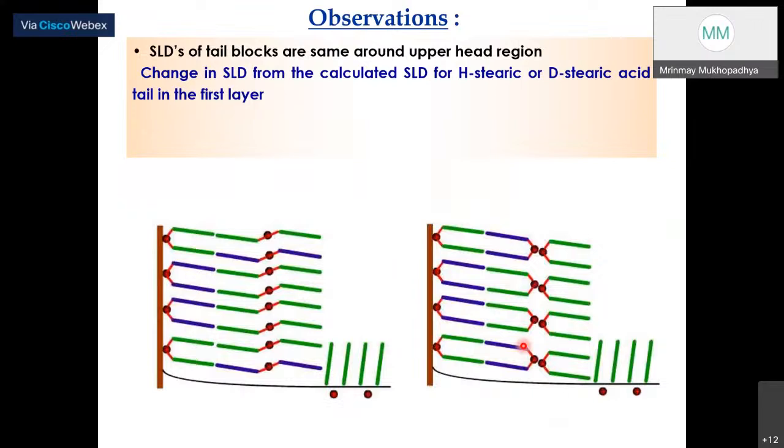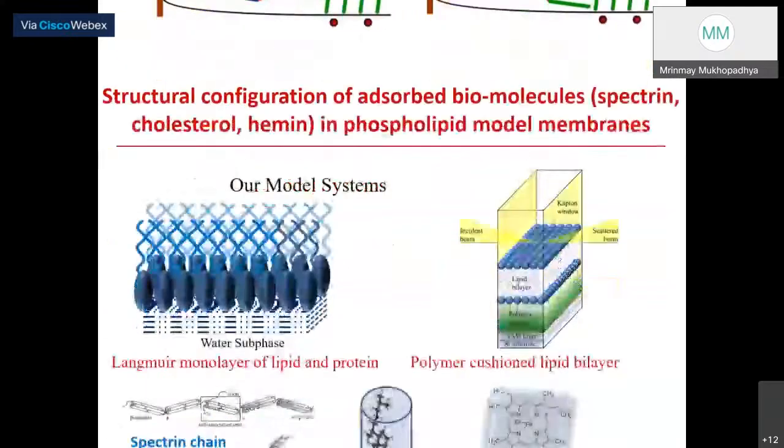So basically, this is the observation: the different color means that you have deuteration. These are deuterated molecules, where these are not deuterated, hydrogenated molecules. So even if you deposit a first layer with a hydrogenated molecule and a second layer deuterated, you can actually see a reassembly or reorganization on the surface of the film, and that is exactly coming out from this.